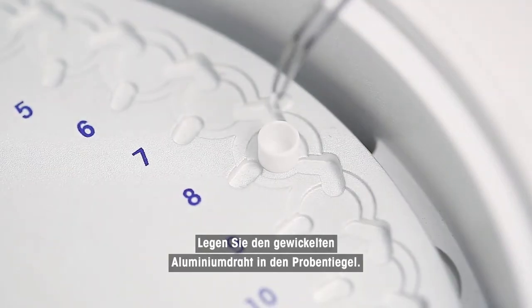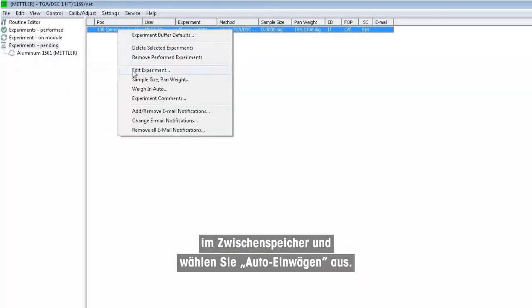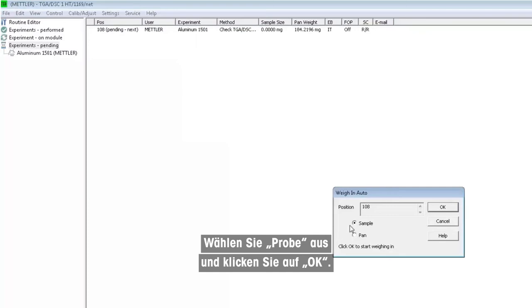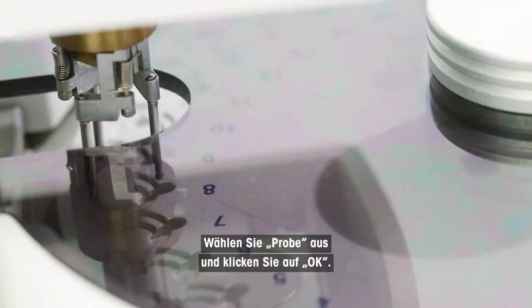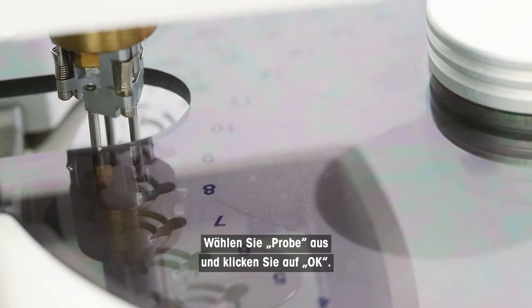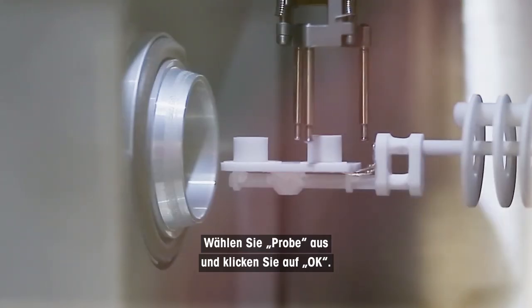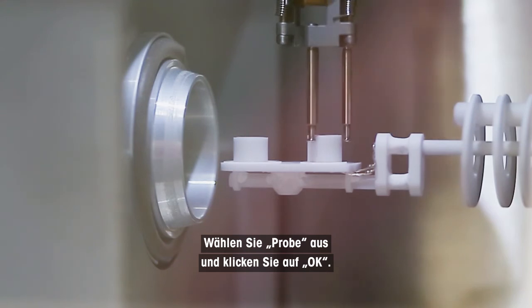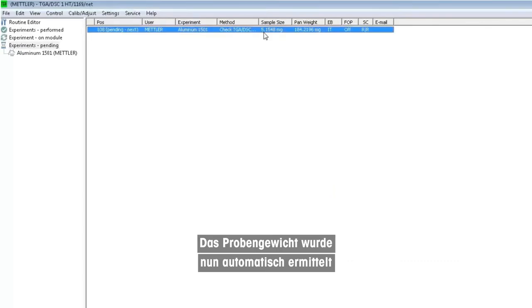Transfer the wrapped aluminum wire into the sample crucible. Right-click on the experiment in the buffer, choose weigh-in auto, then choose sample and click OK. The sample weight has now been automatically determined and transferred to the module control window. Start the experiment.